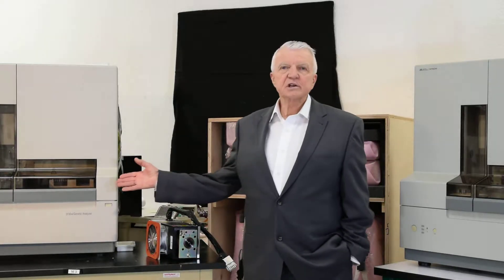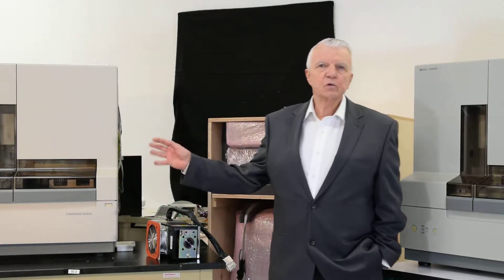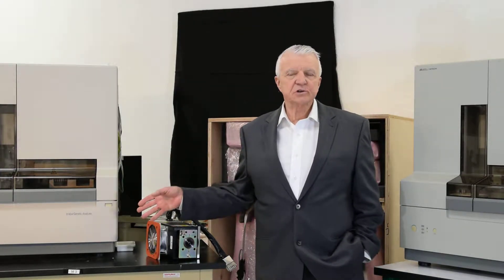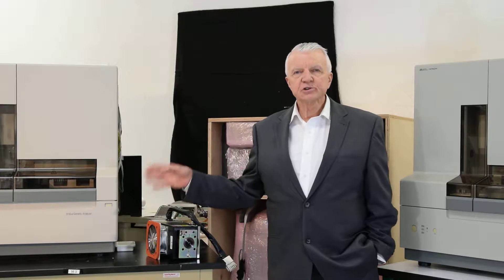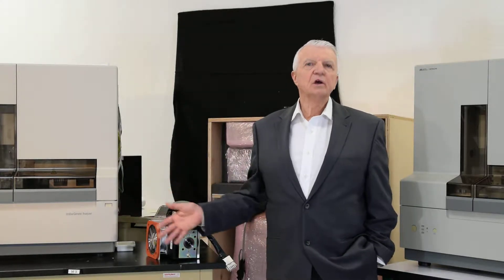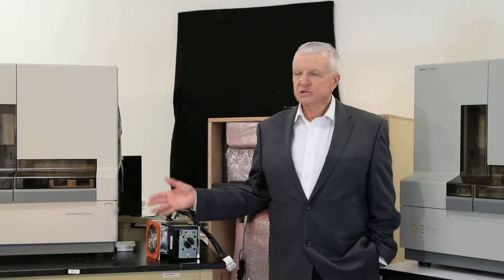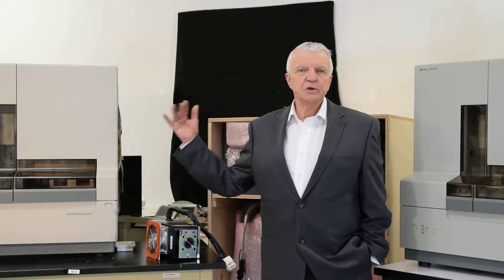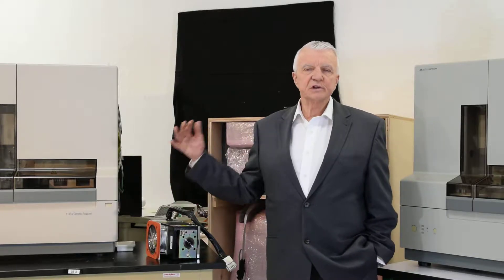On a DNA sequencer, on the back right corner, you'll see the date of manufacture and you'll see the serial number. You should get that on any quote that you get, just like if you were going to buy a car, you would want to know what the VIN number was. That's on the back of the 3730XLs, the 3130XLs, the 310s, etc.